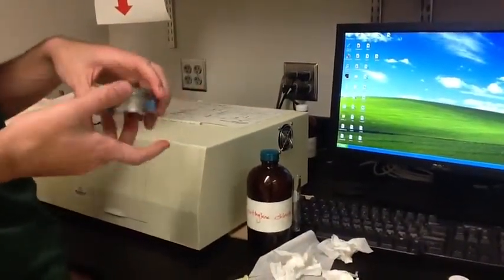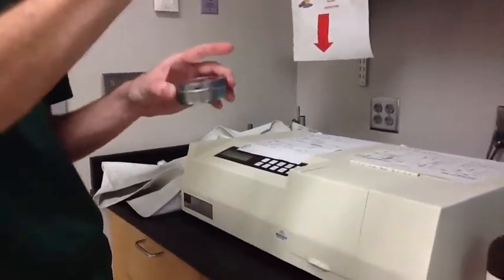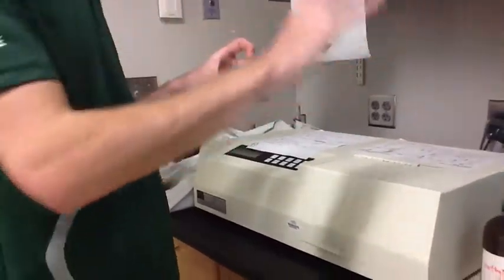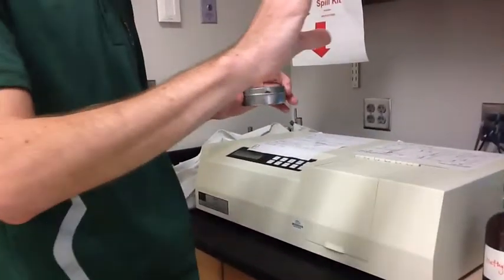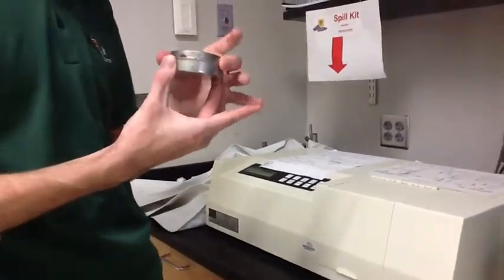I need enough product to spread it out across those plates, so that when the IR ray fires at it, it's going to absorb different wavelengths, and I'm going to be able to get different absorbances across the spectrum based on the functional groups present in that compound. So then you get an IR spectrum.